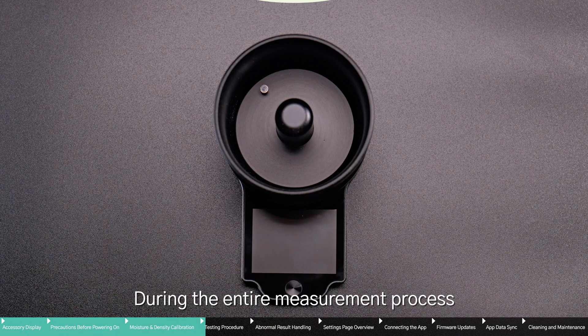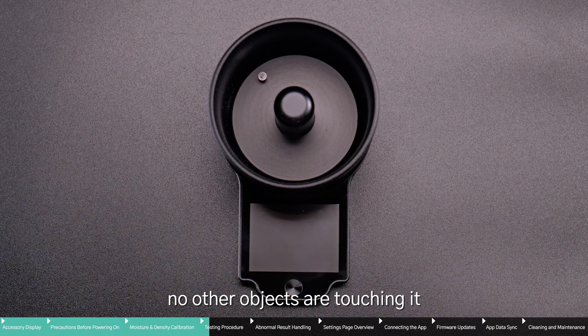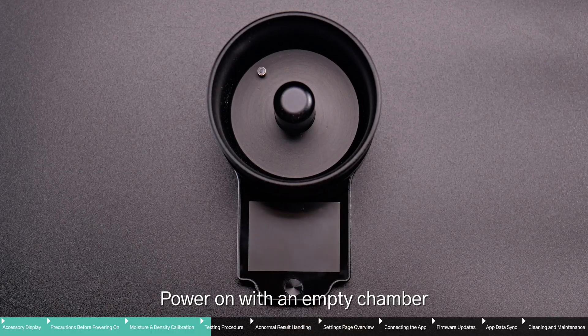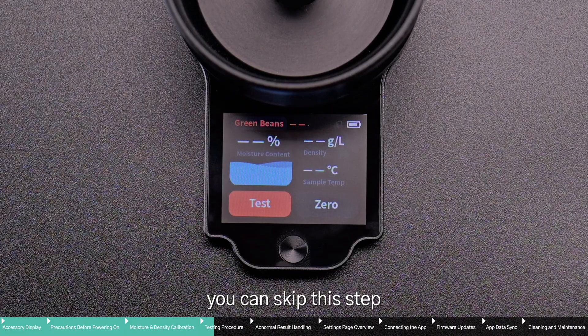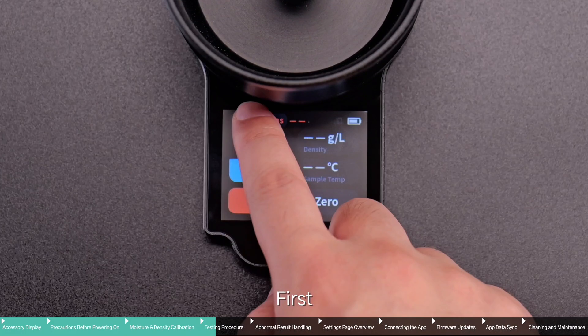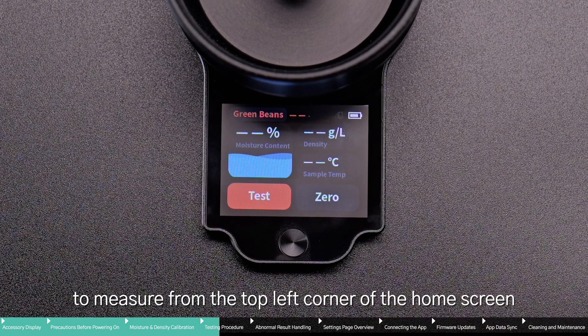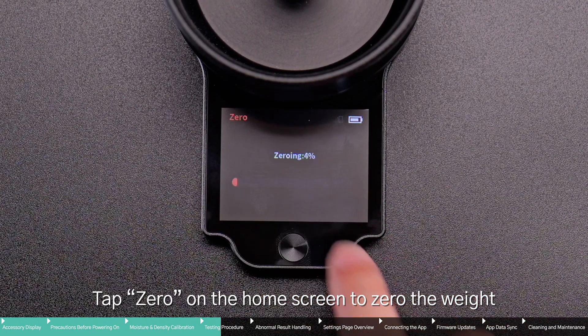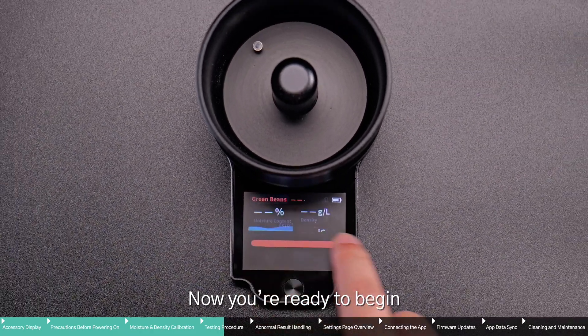During the entire measurement process, leave M1 on a flat surface and make sure no other objects are touching it. Power on with an empty chamber. If you have just completed calibration, you can skip this step. First, manually select the type of sample you want to measure from the top left corner of the home screen. Tap Zero on the home screen to zero the weight, ensuring accurate measurement.